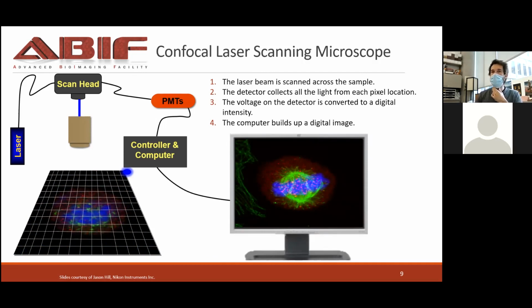And one of the reasons why we insist on making sure this is clear, and hoping this is clear, is that this allows a huge amount of freedom in terms of determining how you're going to acquire images. Essentially, you can tune via the speed of the mirrors and how much they move. You can decide on how much spacing you want between these pixels.